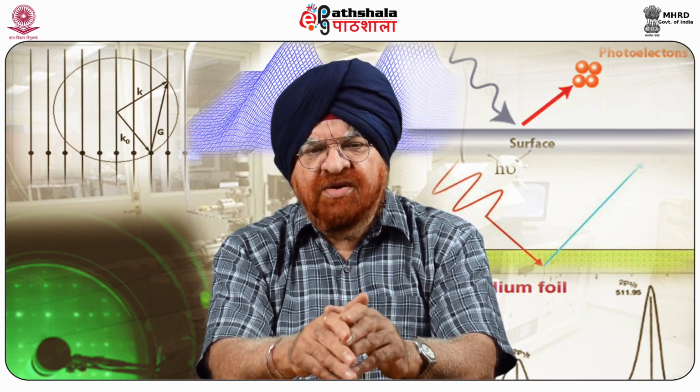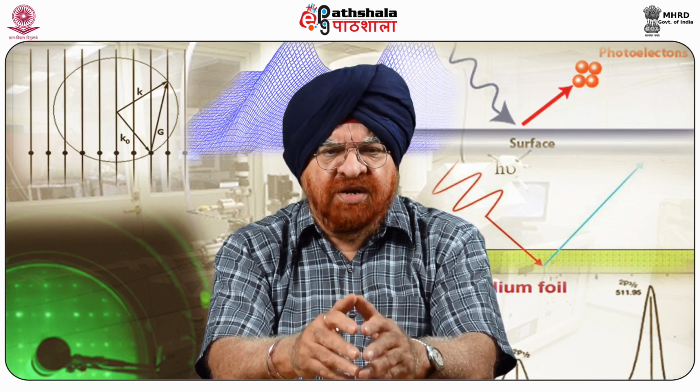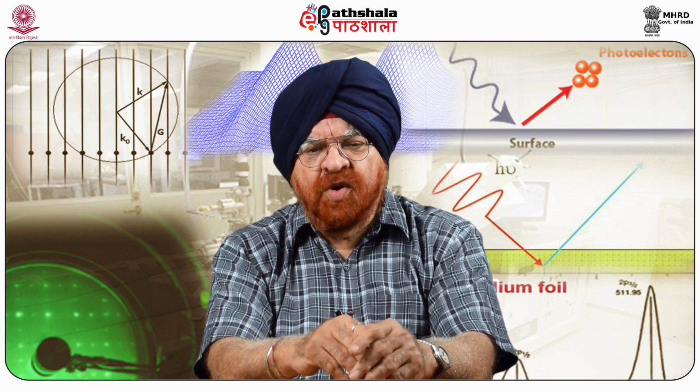Well, when we come down to the introductory part, one finds that a typical force microscope consists of an integrated cantilever tip, this assembly interacting with the sample surface, a detector that measures the displacement of the cantilever, and feedback electronics to maintain constant image parameter such as tip sample separation or the force. The most popular and versatile detection scheme in AFM is through optical lever deflection.